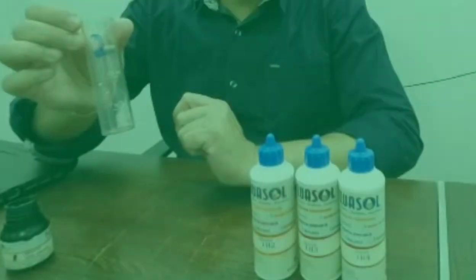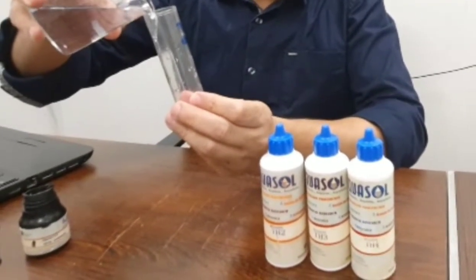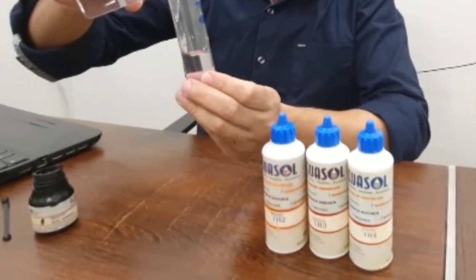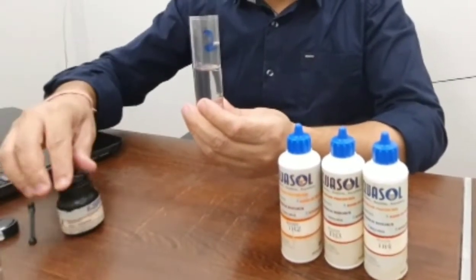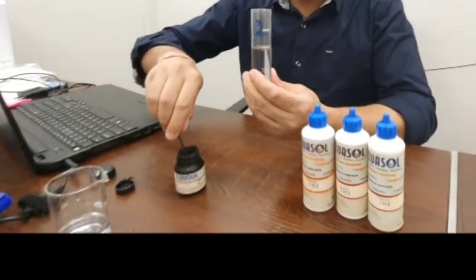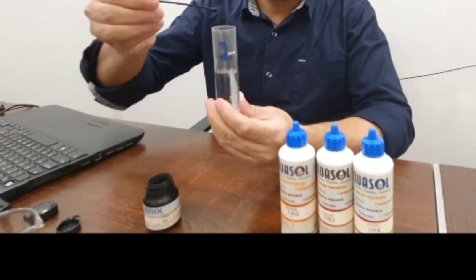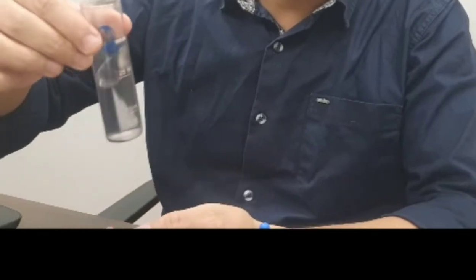Now let's demonstrate the hardness test on raw water. We have taken 25 ml of raw water in a test tube, and the same procedure is followed as we did for the purified water. We add one teaspoon of reagent TH1S, then shake the sample to get it dissolved. Now we are going to add the next reagent, TH2.